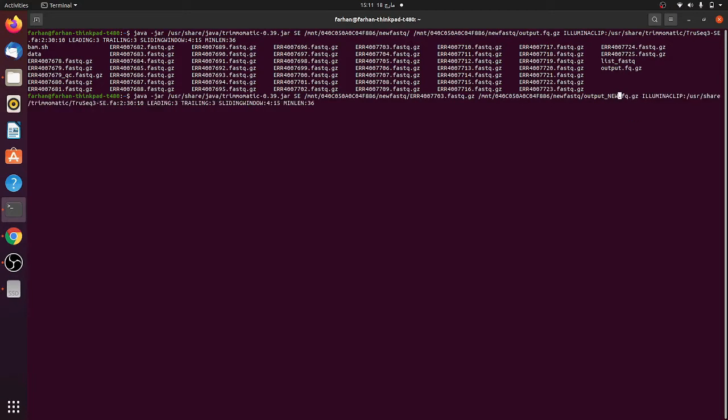This is the command which is used here: Illumina clip. This is one command of this which is present in this Trimmomatic package.